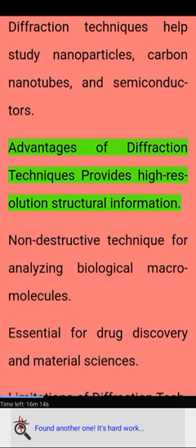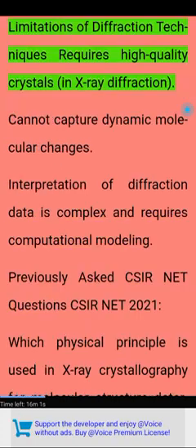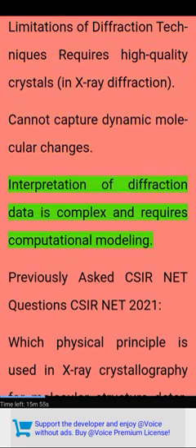Advantages of diffraction techniques: provides high-resolution structural information. Non-destructive technique for analyzing biological macromolecules. Essential for drug discovery and material sciences. Limitations of diffraction techniques: requires high-quality crystals in X-ray diffraction. Cannot capture dynamic molecular changes. Interpretation of diffraction data is complex and requires computational modeling.